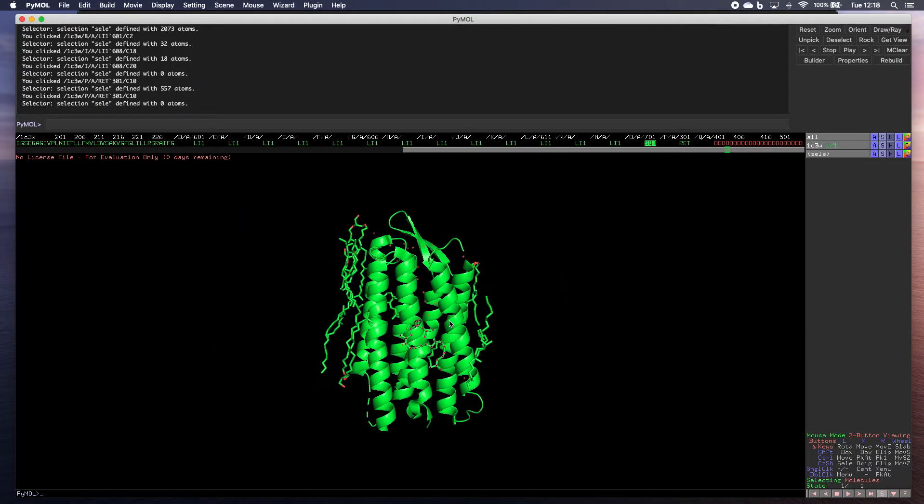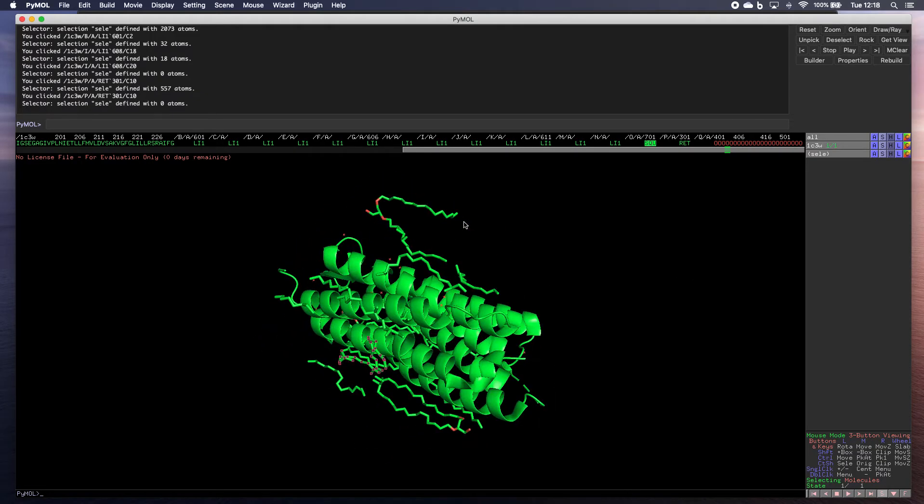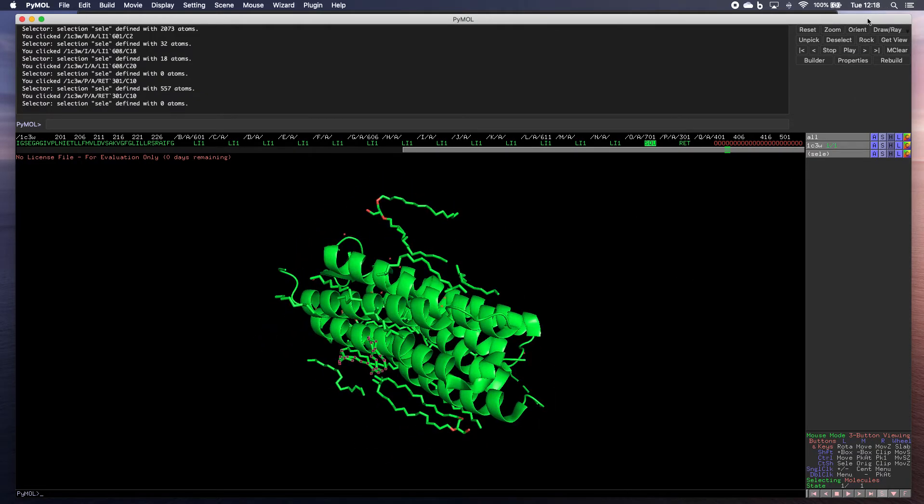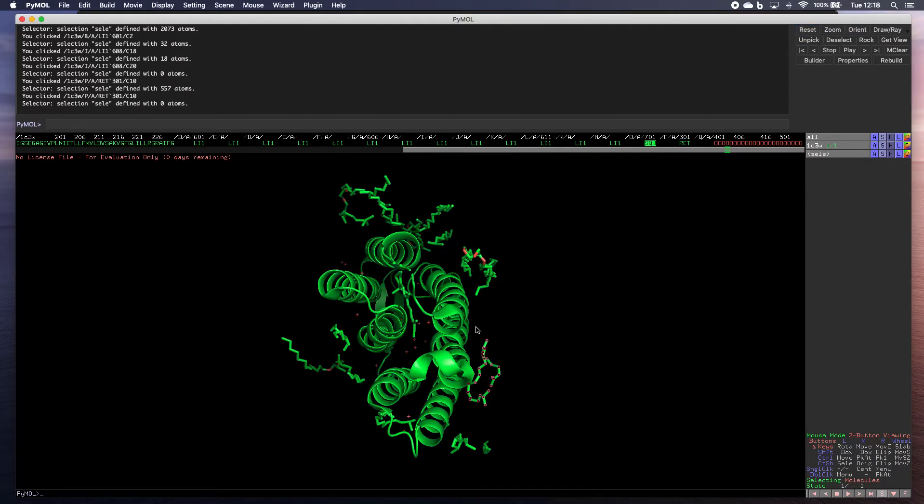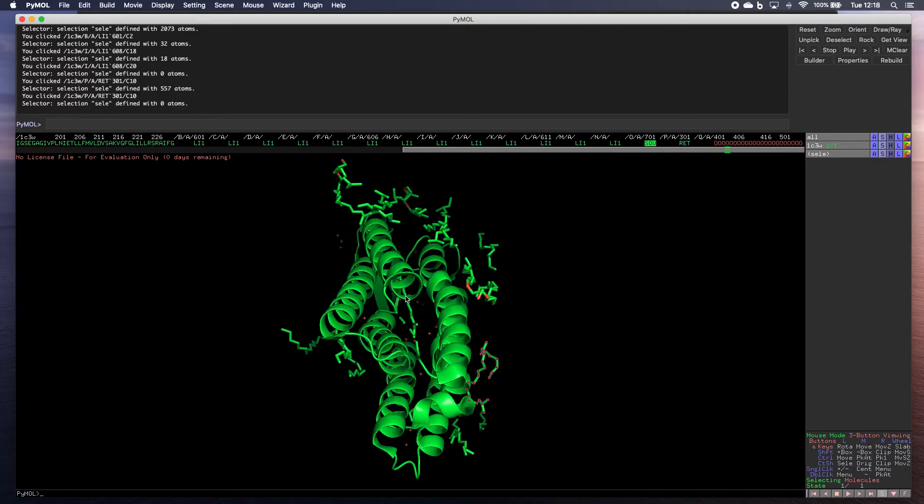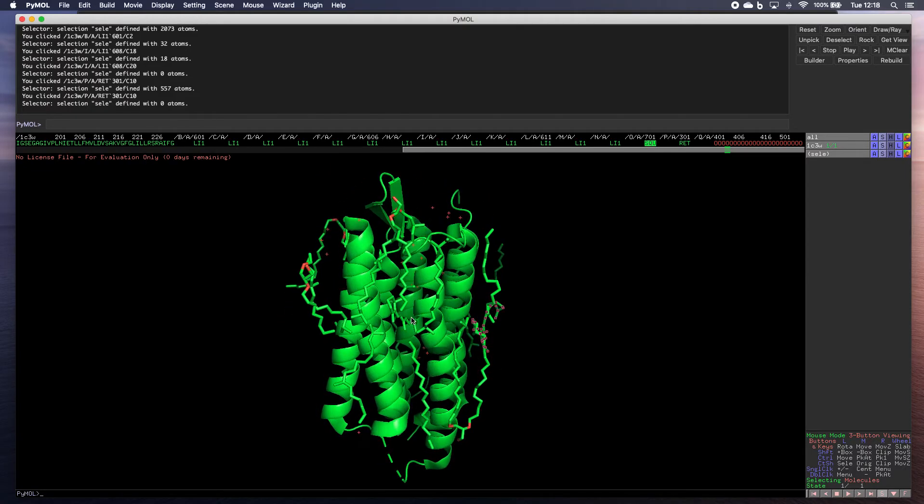Now if you get lost, if you lose your molecule or whatever, you've got it in an orientation you don't like, you can click up here to orientate or reset and that will bring everything back to the middle again.